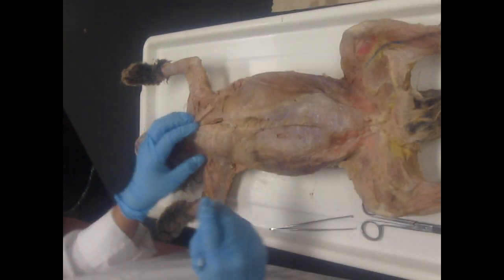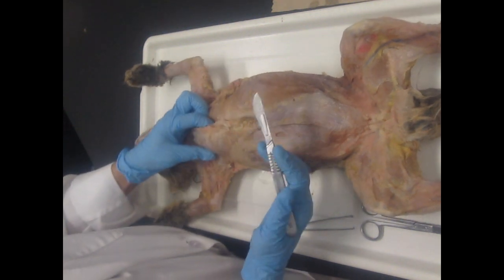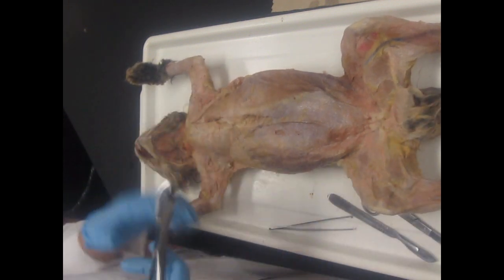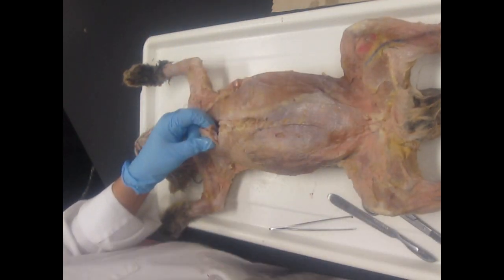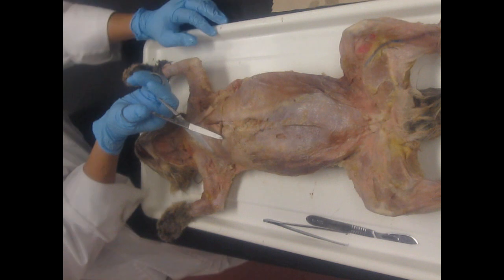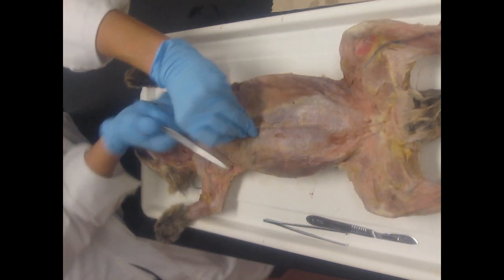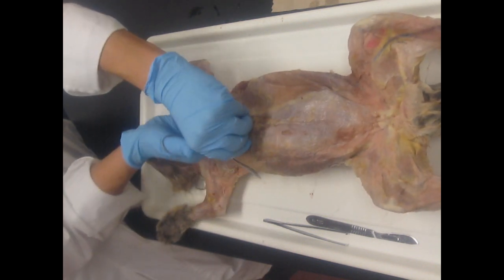What you will need help with is going through the sternum so that you can continue your dissection this way. What you need to do is take your scalpel and just clear the soft tissue off from the sternum, and then call me over. I'm going to use my bone cutters to just get through that sternum for you, just like that. And then you're going to continue the same incision down this way. Okay. So I'm lifting up so that I don't cut the lungs and the heart. And I'm just following that diaphragm. You can see me feeling for it, making sure I'm not cutting it off.